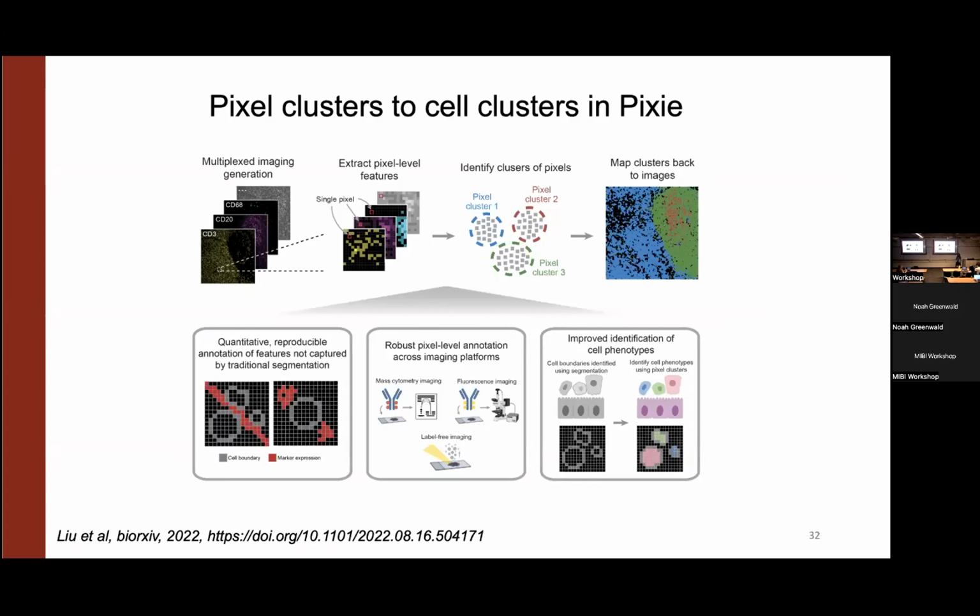So yesterday I talked a lot about how there's a lot of stuff that exists outside of the cellular space, but still obviously cells are very, very important things that you want to quantify, which is why most people focus on the cell level. But this step is actually quite difficult. And so hopefully this pipeline makes it a lot easier to get to those cell phenotypes.